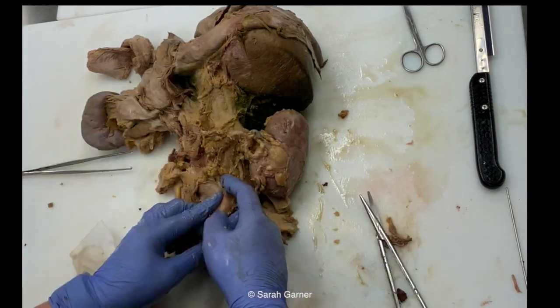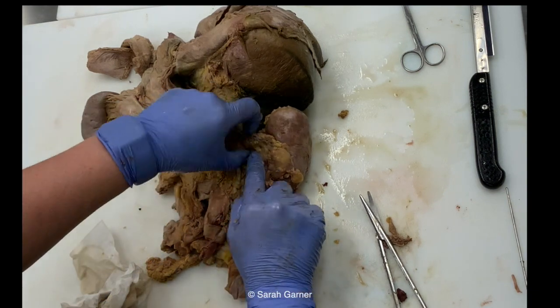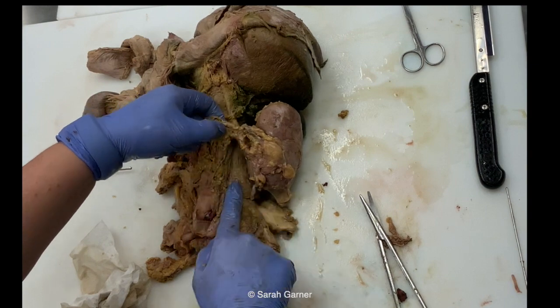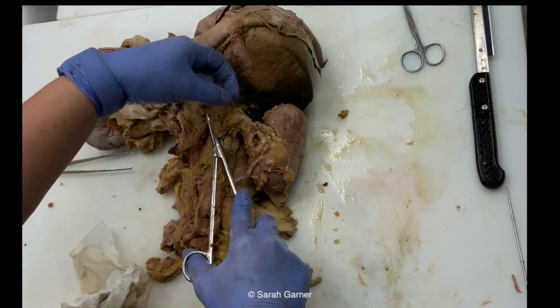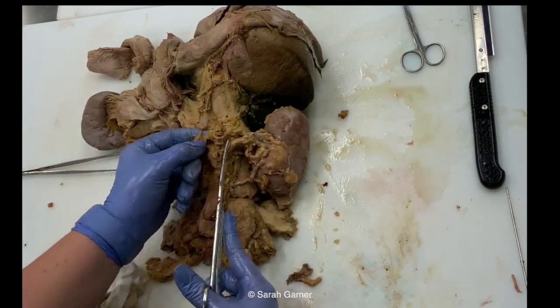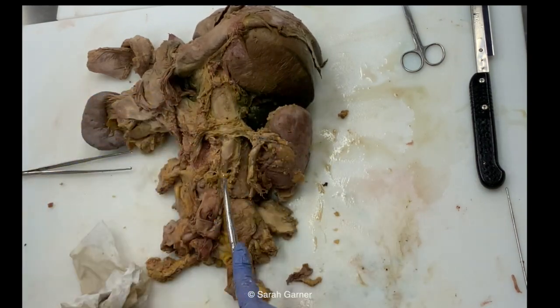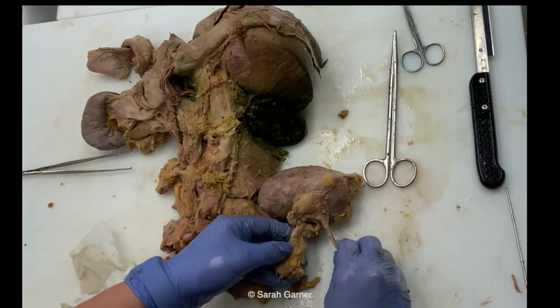All right, so here, this is where we cut our renal artery, right? And we removed the aorta. So that's what we're seeing here. Here we have our renal vein more anteriorly, and then we have our ureter down here. So we can go ahead and cut these. Here's the rest of the renal vein, right here, because this is our inferior vena cava, right? So we can go ahead and cut that. And then we'll do the same thing on this one.